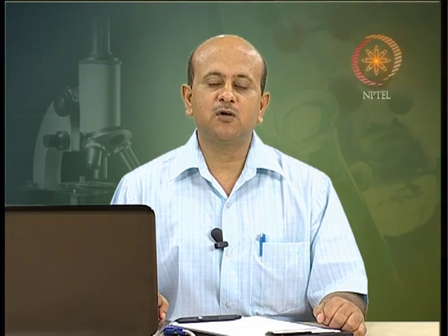Most dispersive spectrometers have a double beam design, and two equivalent beams from the same source pass through the sample and reference chambers respectively. Using an optical chopper such as a sector mirror, the reference and sample beams are alternately focused on the detector, and the change of IR radiation intensity due to absorption by the sample is detected as an off-null signal that is translated into the recorder response through the action of synchronous motors.